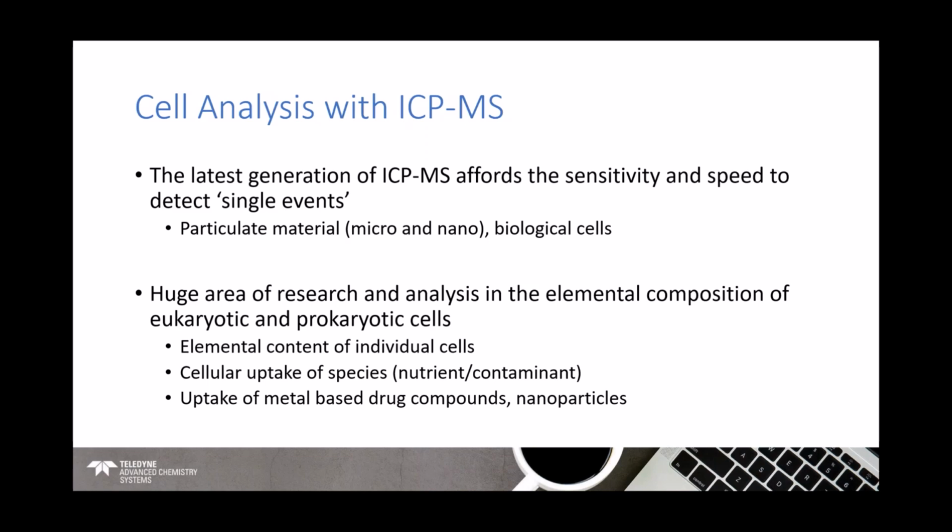As part of this development, it's now possible to capture data from what can be referred to as single events. So we're talking about data that can be captured from small components of a liquid sample, for example, particulate material in the micro or nanoscale, and for what we're going to talk about today, biological cells, which are in the low end micrometer scale.